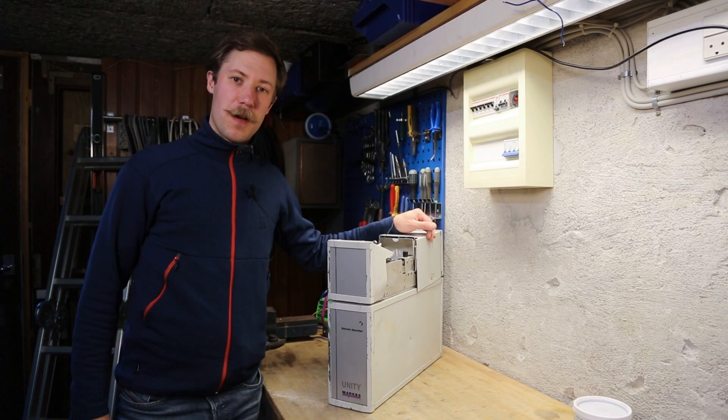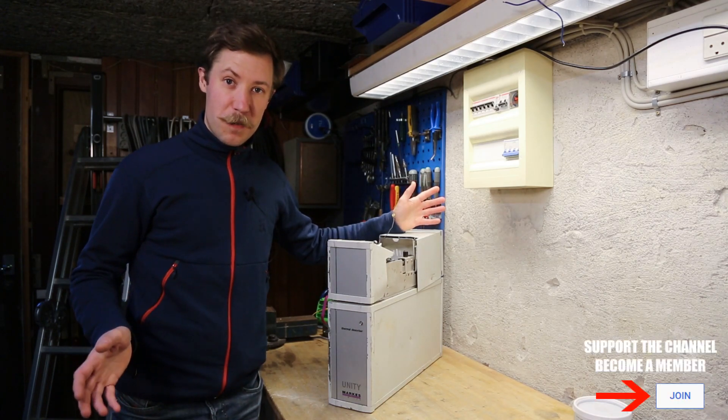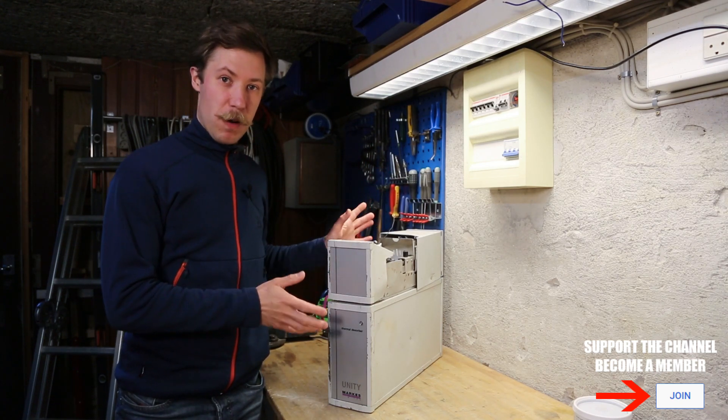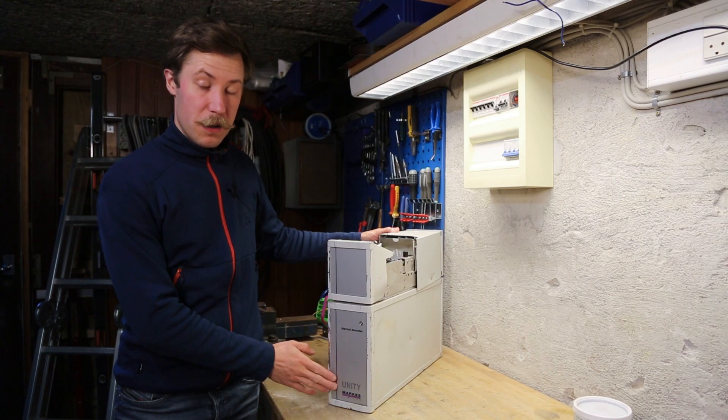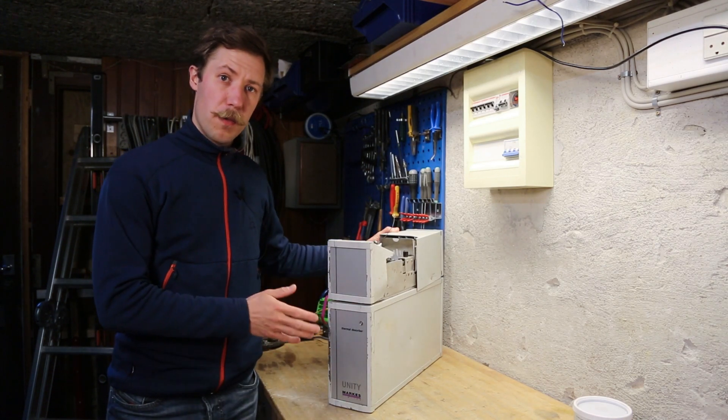Hi all, Mase Bahnkopp from Kaiser Power Electronics. Today I am really out of my comfort zone, because this is a piece of chemical analytic equipment. It's the model Unity from Marks International Limited. It is a thermal desorber.